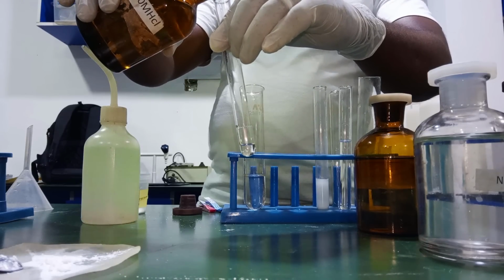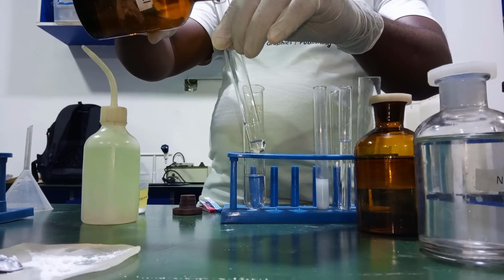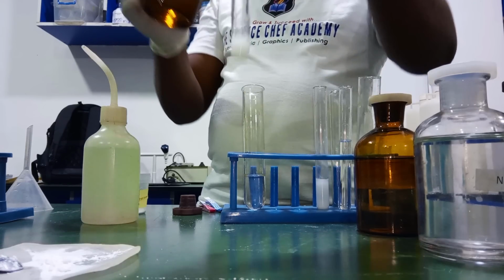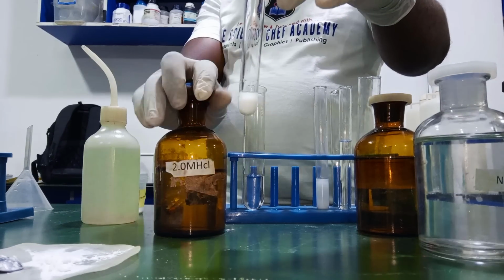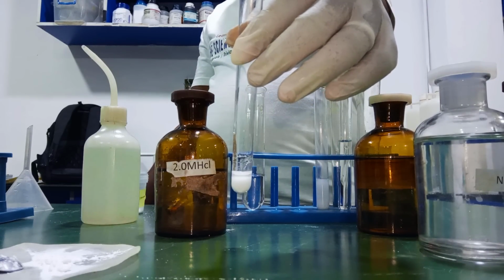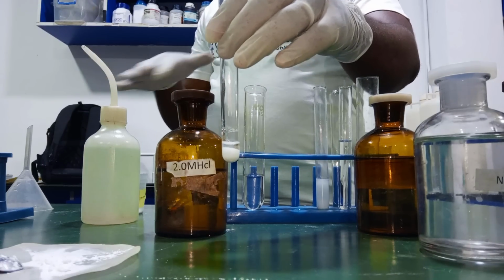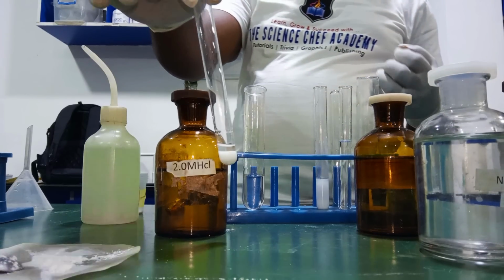I'm adding dilute HCl now. Can you see the white precipitate? So what else do you want? Do I still need to heat it so that it will dissolve and then reappear on cooling? Of course it will dissolve and reappear on cooling, but I can't do that right now. I'm sorry about that. It's already obvious that what we have here is what?